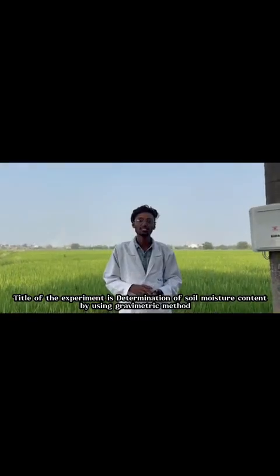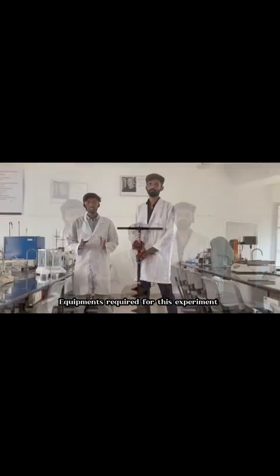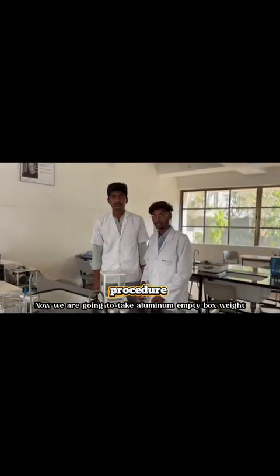The title of the experiment is determination of soil moisture content by using the gravimetric method. The aim of the experiment is to estimate the moisture content present in the soil by the gravimetric method. Instruments required for this experiment: aluminium box, soil sample auger, weighing balance, hot air oven. Now we are going to take an empty aluminium box.